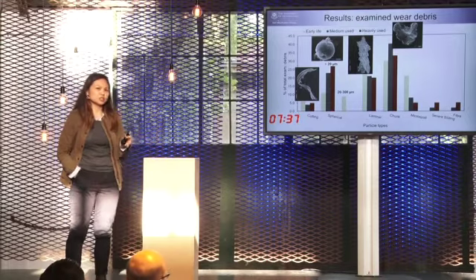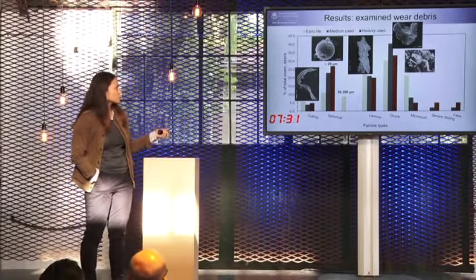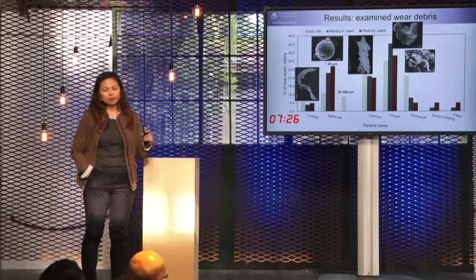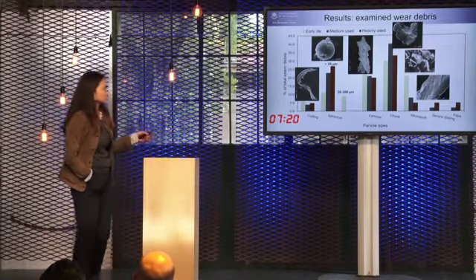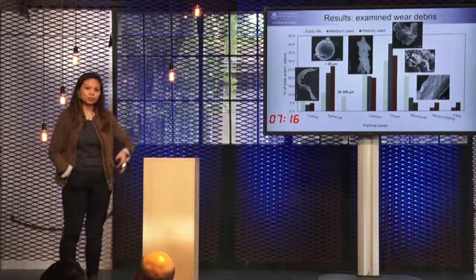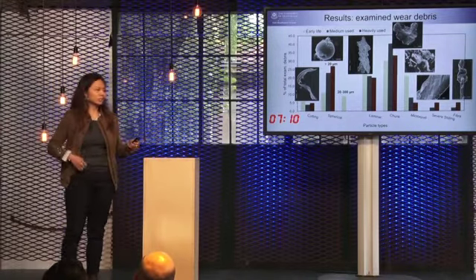Chunk debris normally has an irregular shape with different surface deformation. Microspalling is relatively small, about 1 micrometer in thickness, and you can find it attached to the severe particles. Then we have severe sliding debris, which has a lot of scratch marks running parallel on the surface. The final one is fiber debris, which normally tangles itself.